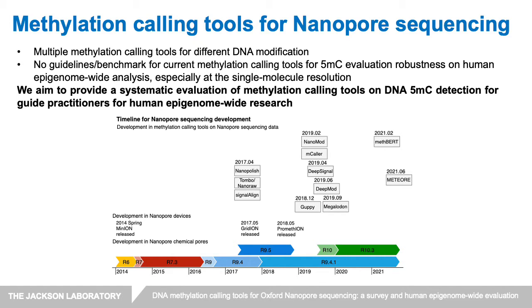However, there is no benchmark on 5mC detection from nanopore sequencing on human epigenome-wide analysis. Therefore, we would like to provide a systematic evaluation of methylation calling tools on human 5mC detection from nanopore reads.